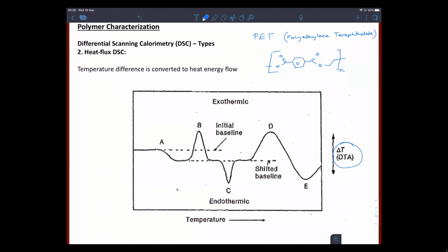So we go through the same process again. We have the TG. In fact, you could do this, right? So there's a TG, TM, and the B is crystallization, cold crystallization, which we'll get back to later. D is a cross-linking. And E is a vaporization.